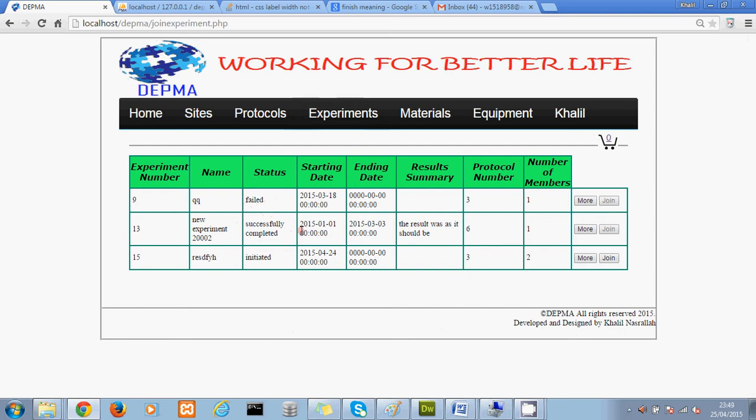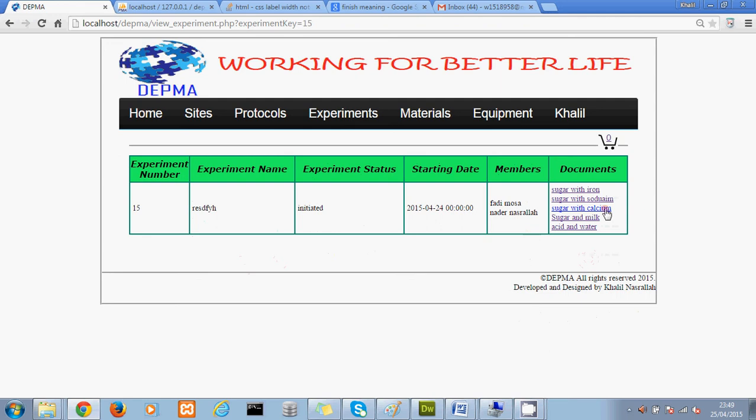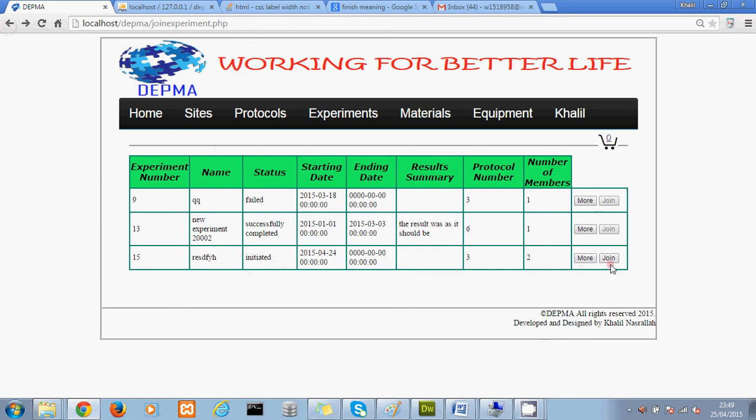Let's say this one is initiated, so the user will be able to join. You can also go and see what documents have been created for this experiment and everything about it: members, starting day, experiment status. So let's go back and click join.